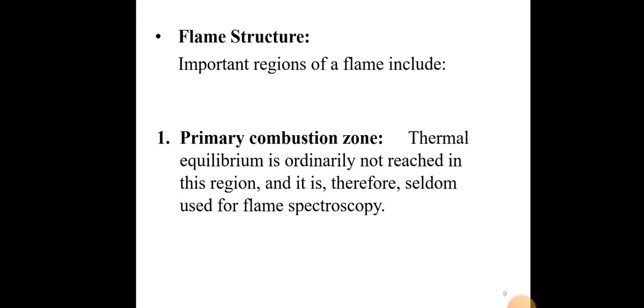Now we are going to talk about flame structure. A flame has three important regions. The first region is the primary combustion zone at the bottom of the flame.